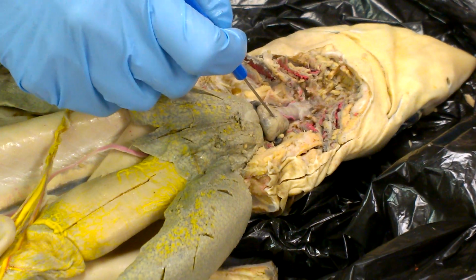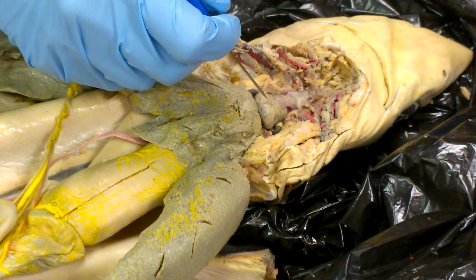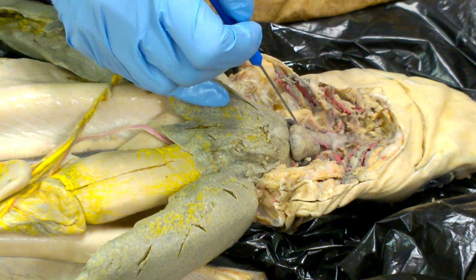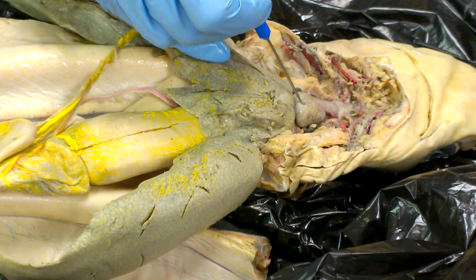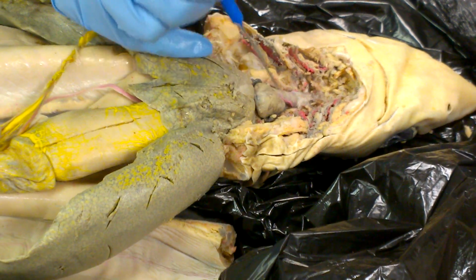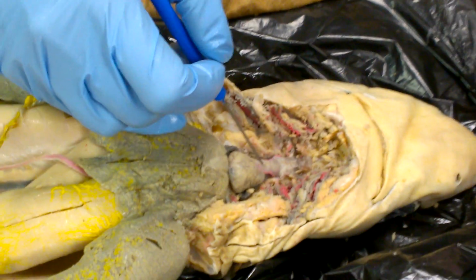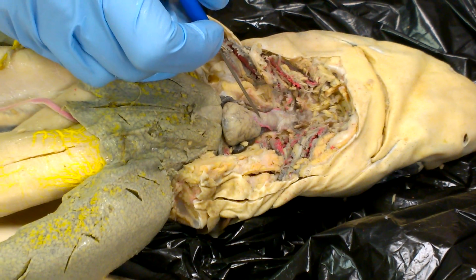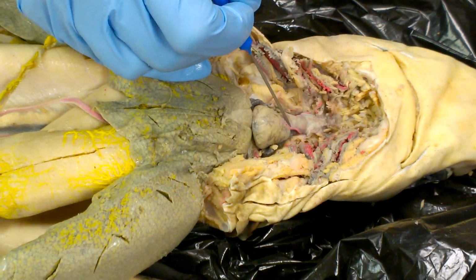Does it filter out the? Nope. It's way less tricky than you're thinking. What's the job of the heart in general? Just pumps it up. Is the atrium doing any pumping? No. So what's the job of the ventricle? Excellent. Okay. So the blood goes from the ventricle into this tube right here. Something conus. The conus arteriosus. Because now it's arterial blood leaving the heart. Okay. So it's the conus arteriosus.